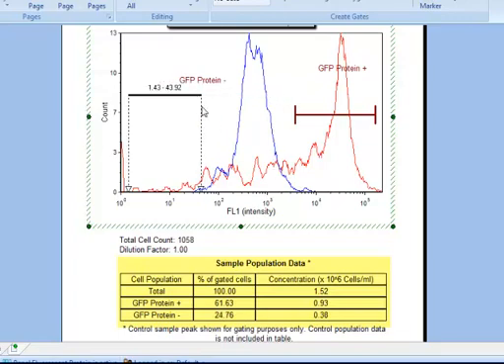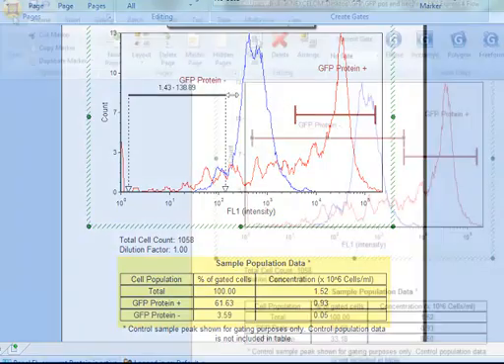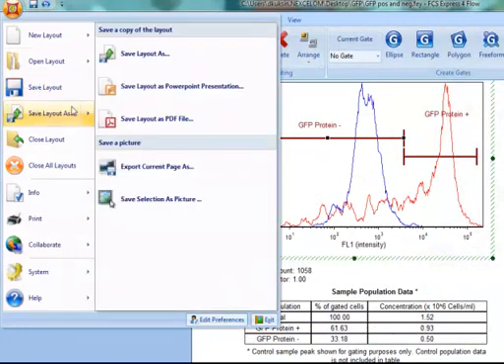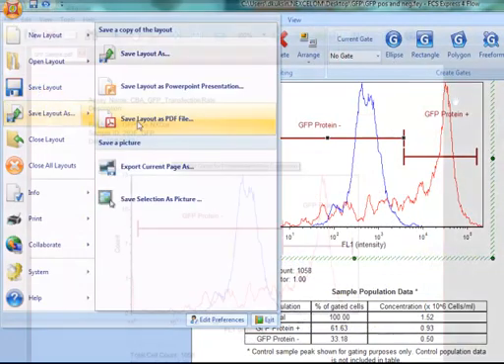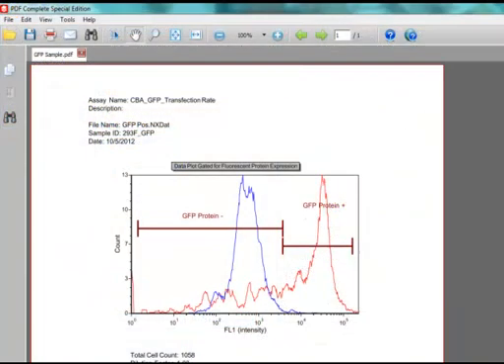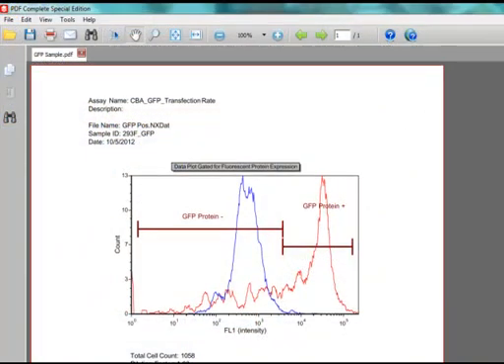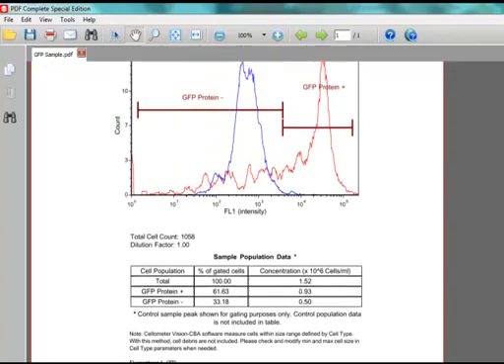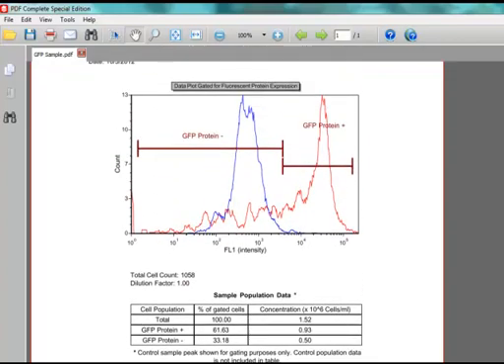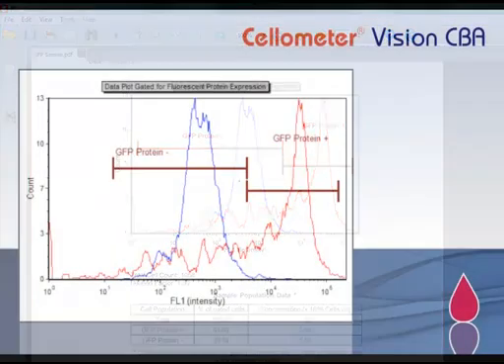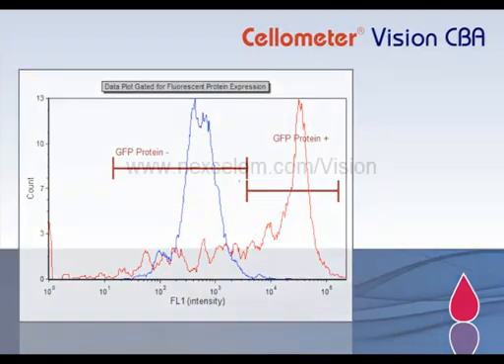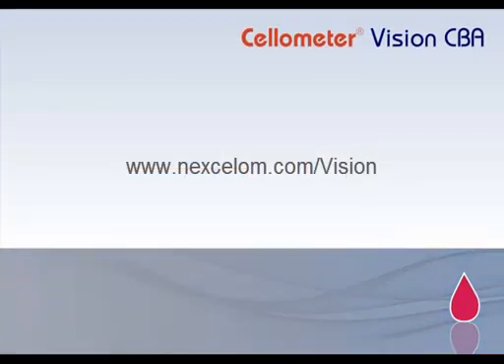Data tables, graphs, and images can be automatically saved to a secure network location and exported for presentations and publications. Learn more about the cellometer vision CBA for cell-based assays at nexcelom.com/vision.